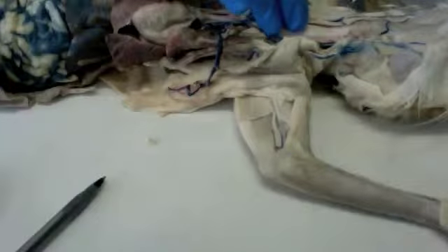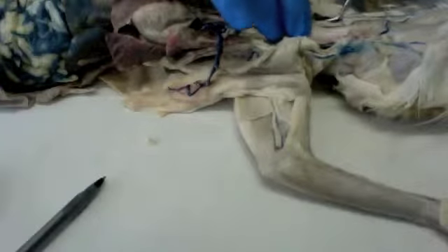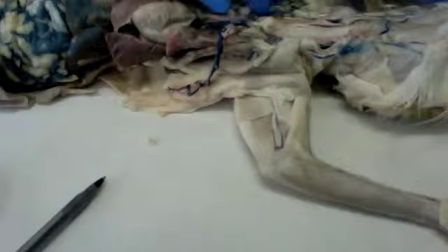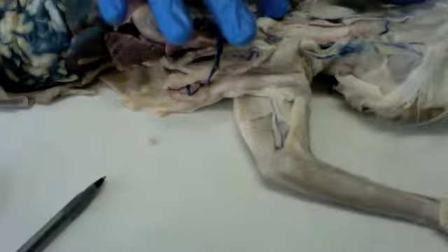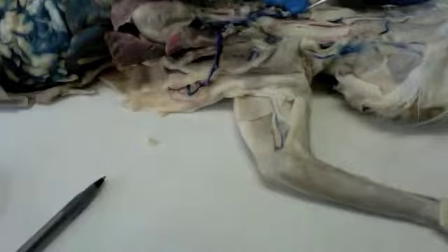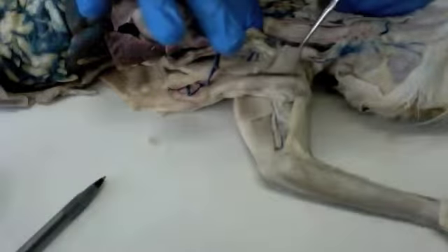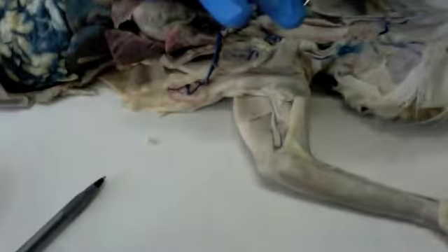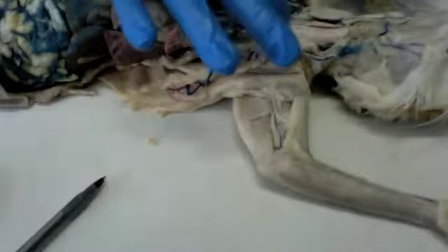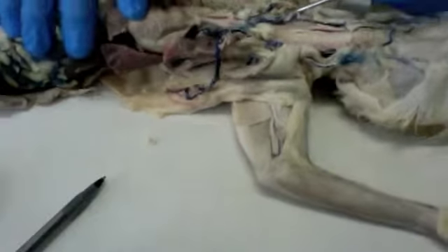And then we have the external carotid arteries, which is located here. It's still a little attached. This is the external carotid artery. This is of the left side, and then the right side one got cut, but this is the left external carotid artery. I have my piece underneath it right now.